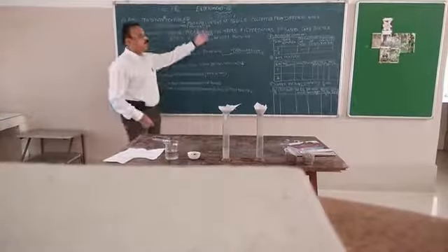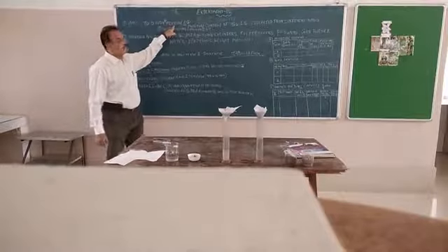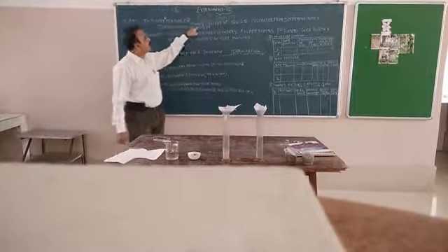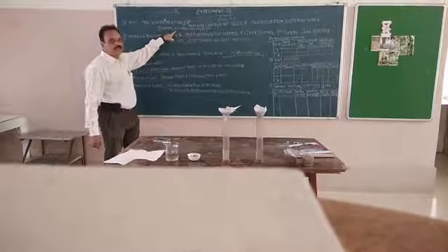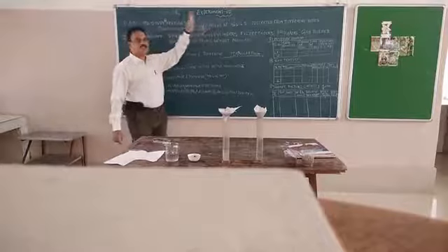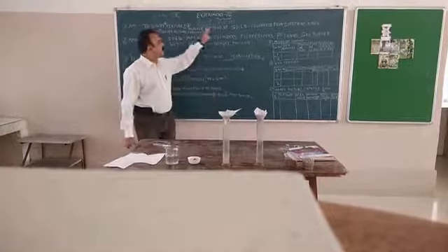So what are we going to do today? To study the texture of the soil, moisture content of the soil, water holding capacity of the soil, and pH of the soil. Four things we are testing.